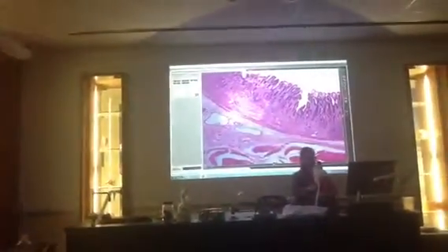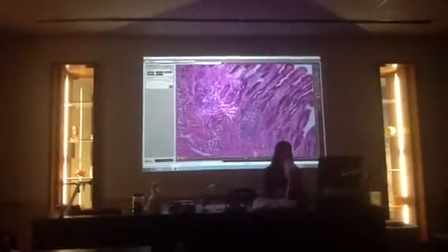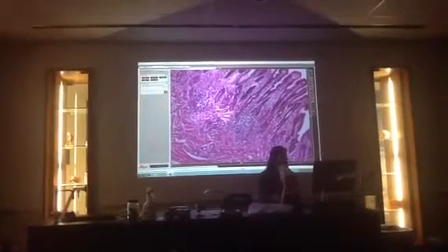We're going to go up one. It's hard to see it.